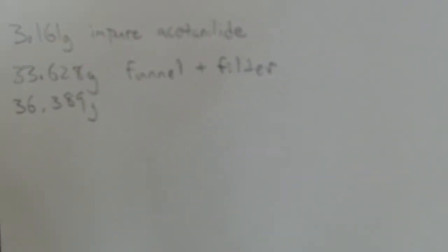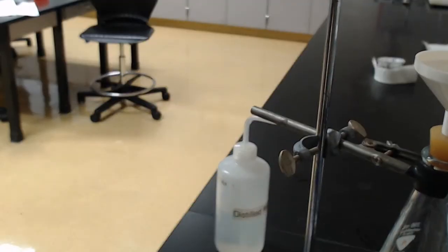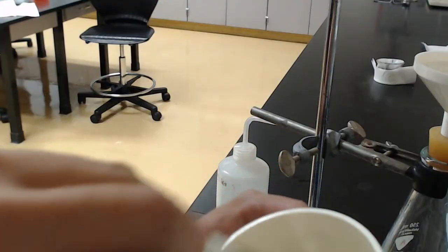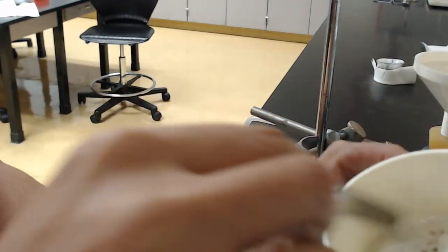Okay, I got a weight so there's my mass numbers. All right so we have 36.389, that is the weight of the funnel, filter paper, everything here. So you get the mass of the recovered acetanilide by difference, so you guys do that calculation, it's this number minus that number. And I want to take a look at this stuff here real quick before we move on. So let's show you what it looks like when I break it up. It looks just like glitter to me. There we go, pure acetanilide looks way different than what we started with right?